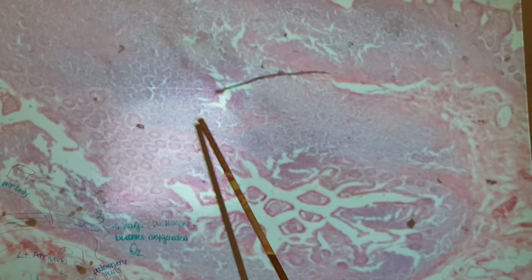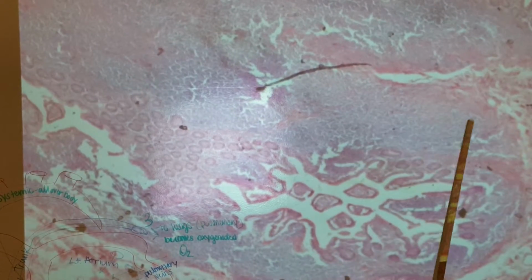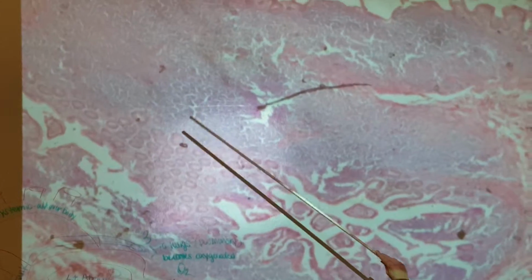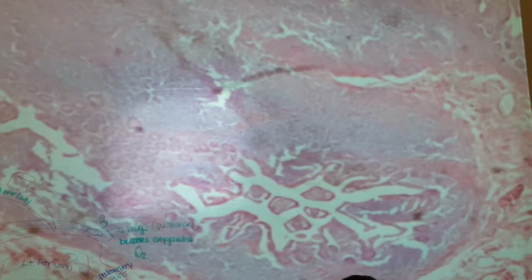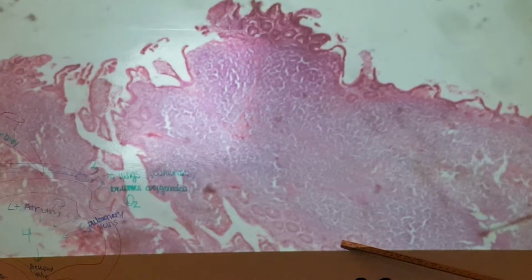What is all of this up here? Lamina propria. It's a giant lymph node. Really? So see how it just stops the normal look of it, and then it voids out everything else. Wow. It's a giant one. Because at the very top of it is where we get back to the lining. So it just kind of shuts everything else out. It grows right up to it, pushes everything away, and here it is again.